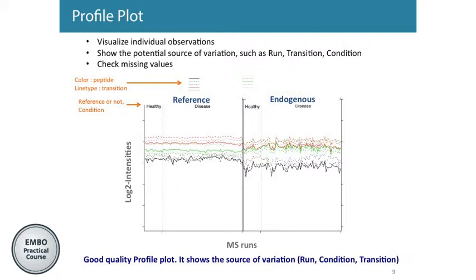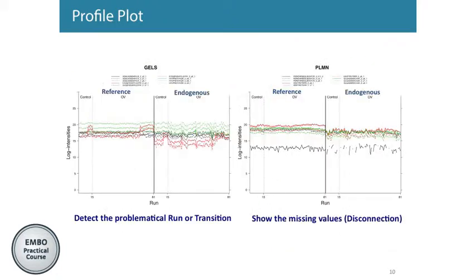So this is really good for checking the quality of your data. For example, this is one of good quality, and this is another example.